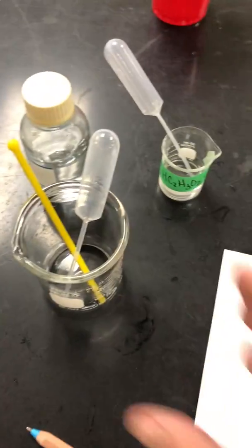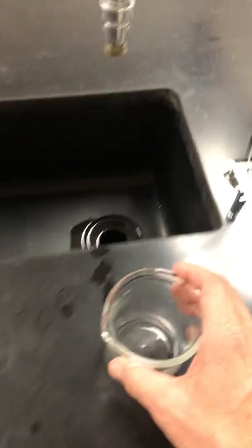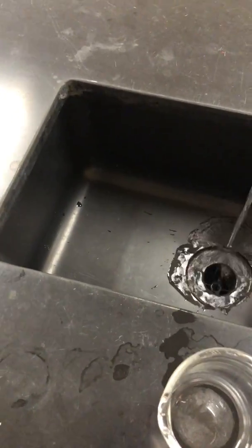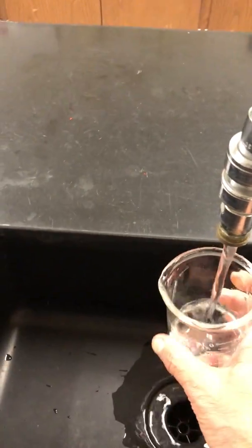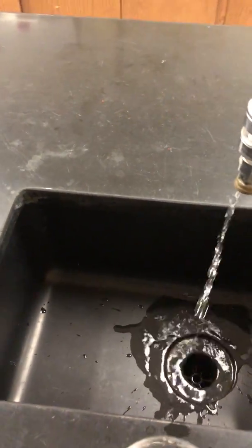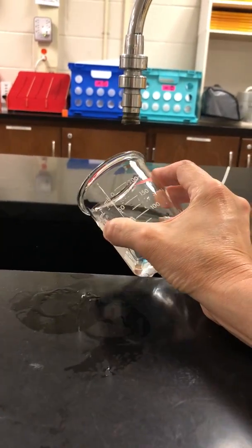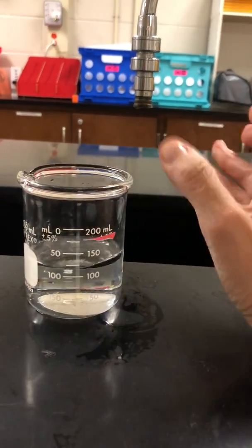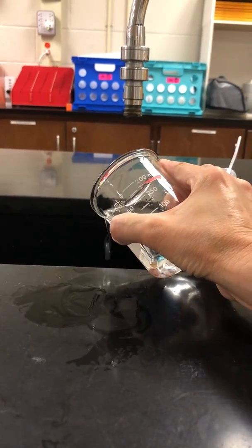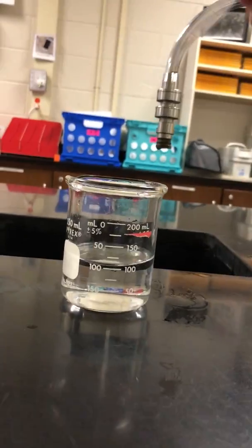Okay, so let me do that. Let's get some water in here. All right. And we want it to be as precise as we can. So we come down here and whoa, okay, I went way over. Let's fix that. Because you do not want to spend all day using the pipette.